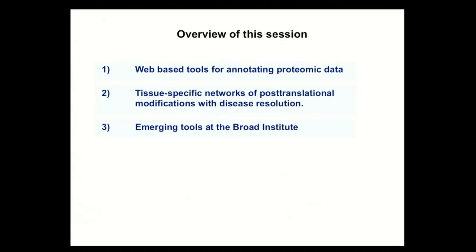And I'm going to give a very short introduction to web-based annotation tools used in the proteomics space. This is basically going to be a resource list that you can then test and check out yourself. These different tools are quite well explained, so the major reason for showing this is not to explain all of these tools to you, but just to make you aware of what the people in Steve Carr's group and other groups are using, and then you can start using these tools yourself because they're quite user-friendly.